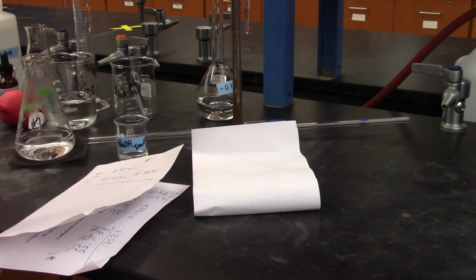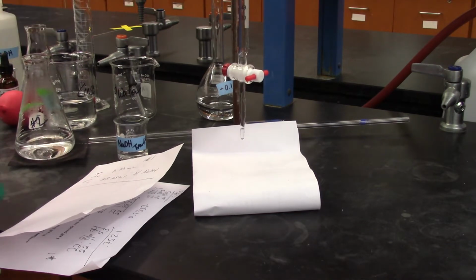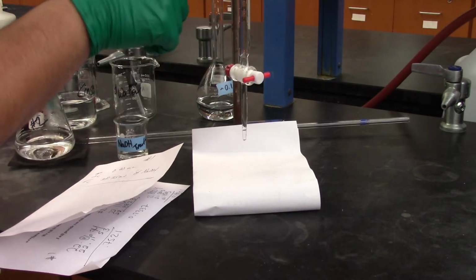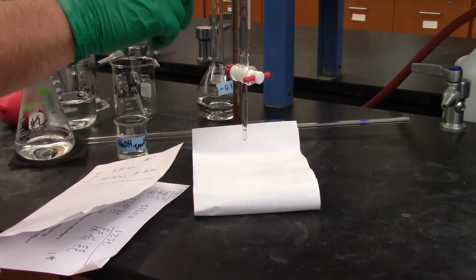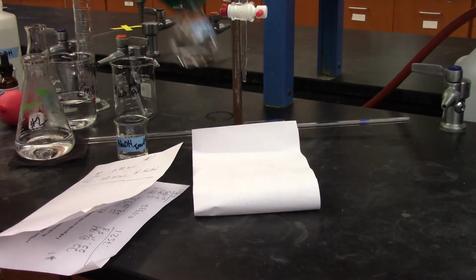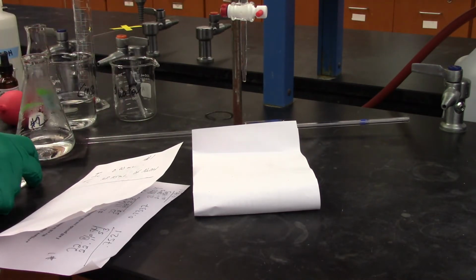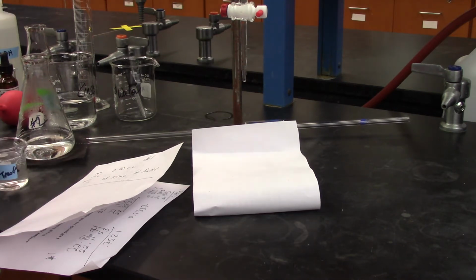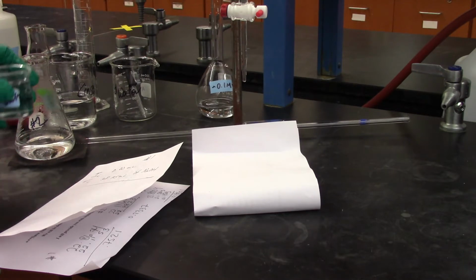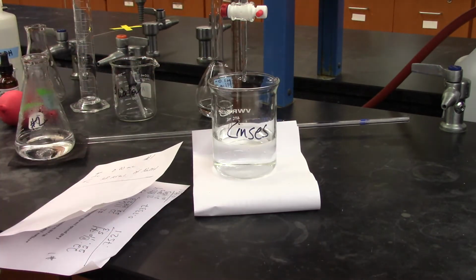So you want to make sure that your burette has enough solution to do a titration. That last one took about 38 mils. I'm at about 47 here, so I only have 3 mils to titrate. So I'm going to want to refill my burette. If you have enough solution, which you should, because we did prepare 250 mils of this with only a few rinsings, you should be able to just bring it back to 0 and stay consistent. That's what we suggest for you to do. I'm going to make sure to have my rinses below in case anything spills, and I'll set this back to 0.